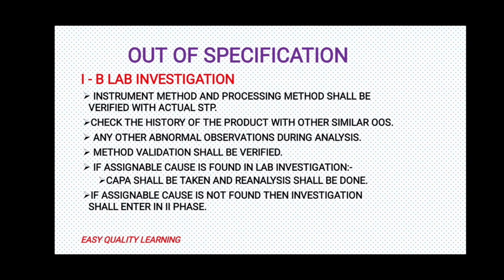Then instrument method and processing method shall be verified with the actual STP. So we need to verify the instrument method, that is what was the flow, what was the wavelength we used, what was your runtime, and other parameters which were fed to the instrument, whether they are matching with the STP as well as with the historical methods which are used or not. And we need to also check the processing method for processing of the chromatograms.